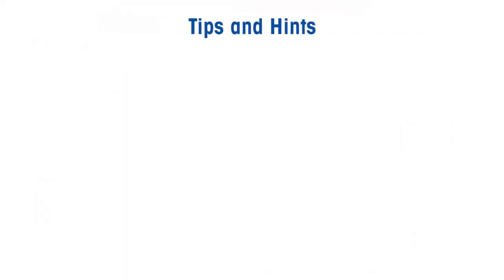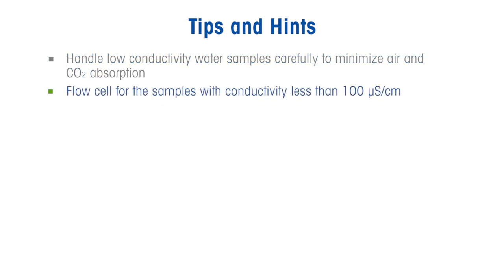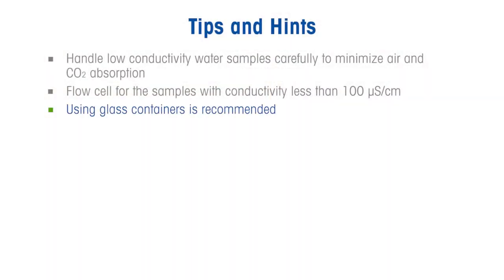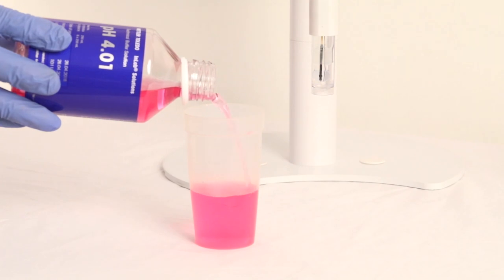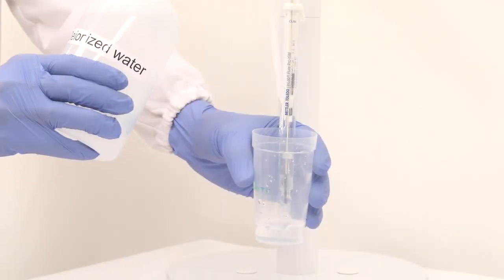Some tips to get accurate and precise results: take maximum care to avoid any exposure of the sample to atmospheric carbon dioxide, even during sample handling. If possible, measure the sample directly from the source. Use a flow cell for water samples with conductivity less than 100 microsiemens per centimeter. Use glass containers, since air can diffuse through plastic. Test samples as soon as possible after collection to minimize temperature changes and contact time with the container. Make sure all containers and tubing are well rinsed with pure water before use to avoid cross-contamination. Always use fresh buffers for electrode calibration.